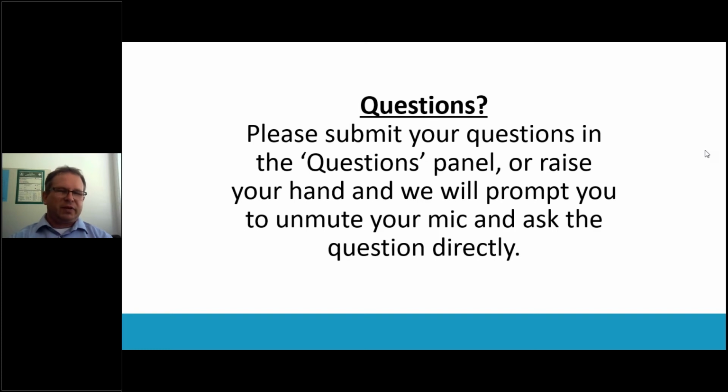Thank you very much for the interesting question. Now I have to split the answer to this into two parts. One is the DVS measurement. For the DVS measurement, we are really taking care to reach an equilibrium value. That means there should not be any gradients anymore, basically, and especially for the thin material, the 10 micrometers, I would say, in orders of magnitude, it's not the exact value, but we can be quite sure that the distribution will be uniform and really representative for, so to say, the bulk material.